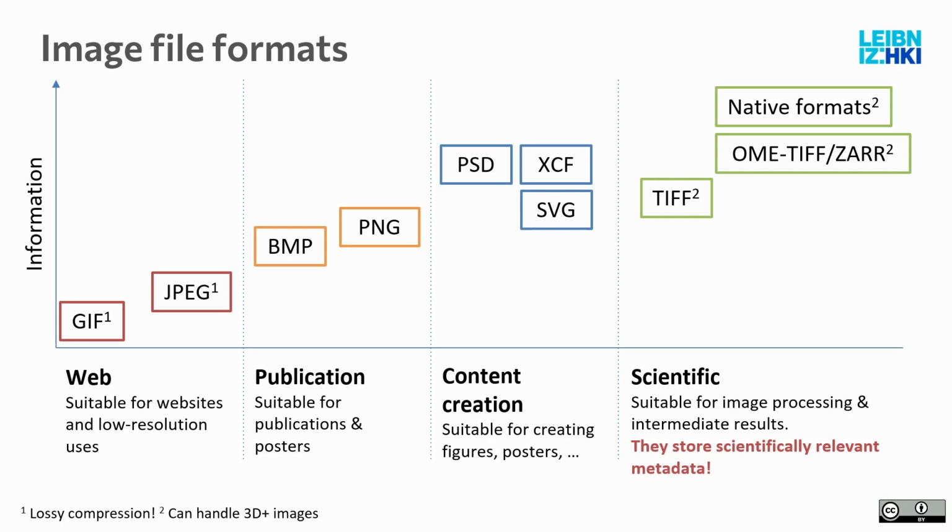The native formats might contain a bit more information, but these are also usually fine, this OME-TIFF or Zarr, to save your data. And these are also the formats that are related to this image database, OMERO, where you can upload images to the cloud, which is made for scientific purposes.